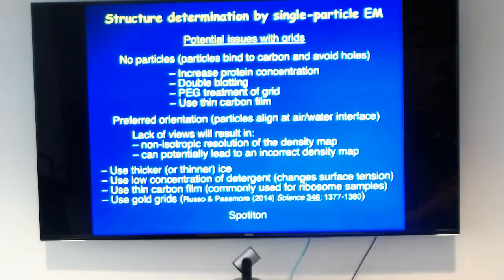Because the paper says you can get to high resolution. You got the structure at 3 angstrom. Why is this not a good solution? It hasn't been so easy. The throughput is just not very great. In my experience, one, you start to get thicker ice. You're literally limited to using gold grids because you have to tilt your grid, so you're going to have a lot of drift. The defocus gradient, there are a lot of different methods to estimate the defocus across that inherent gradient. It's not entirely sure what is the best way to do it or how accurate it's measuring it.